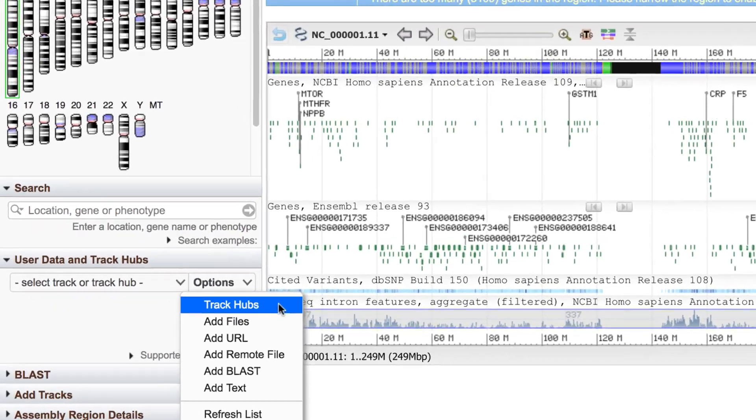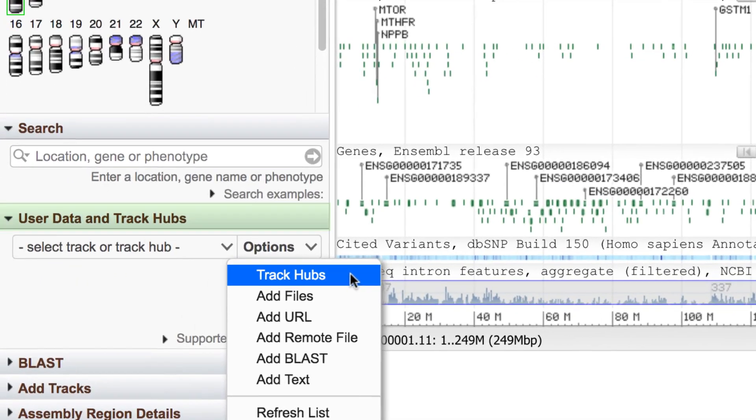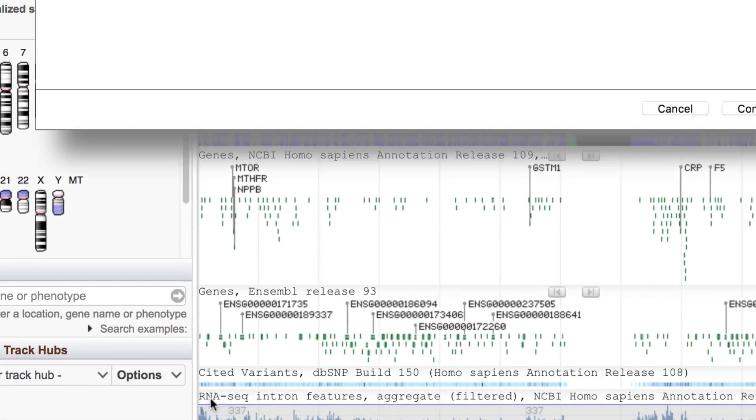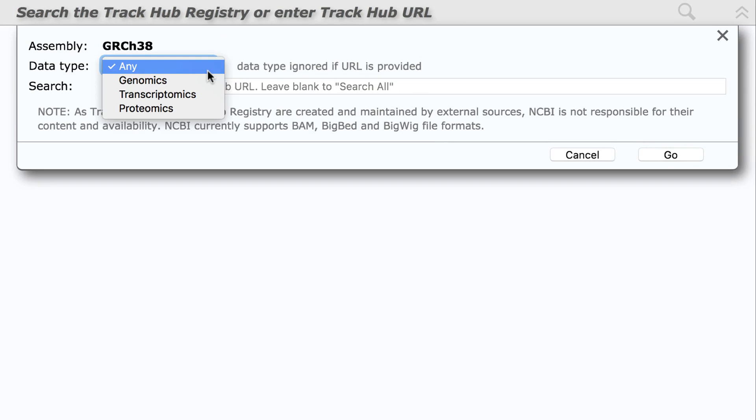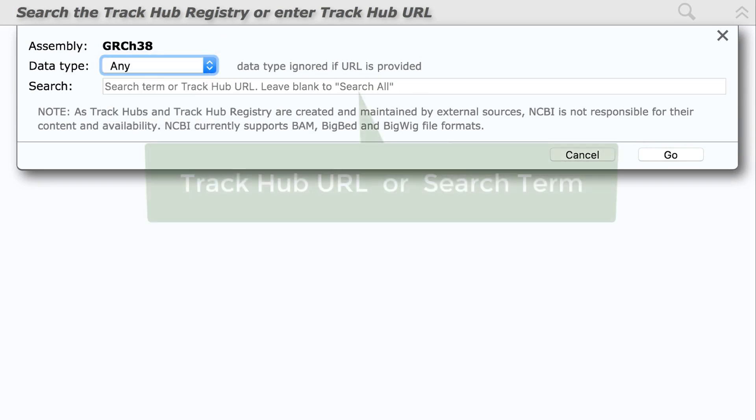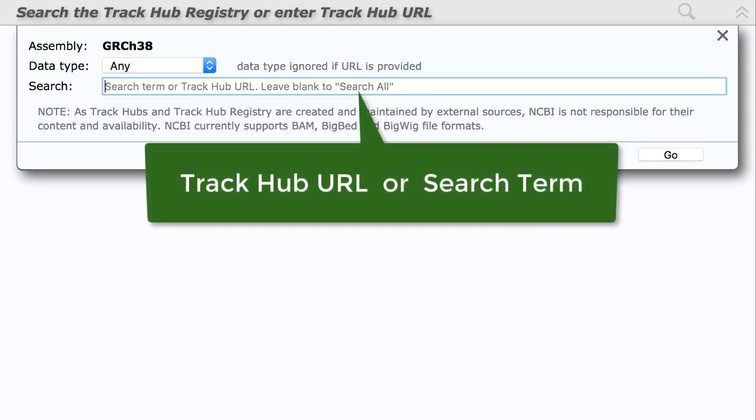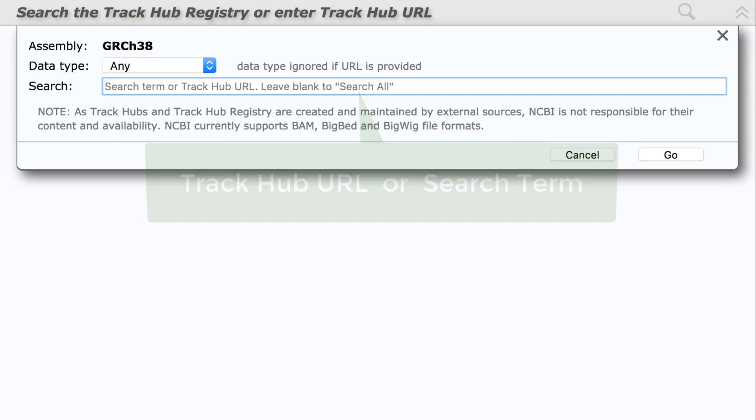We've added a TrackHubs option to the User Data widget. Here you can input a known TrackHub URL or search the TrackHub Registry, a resource based at EMBL-EBI.